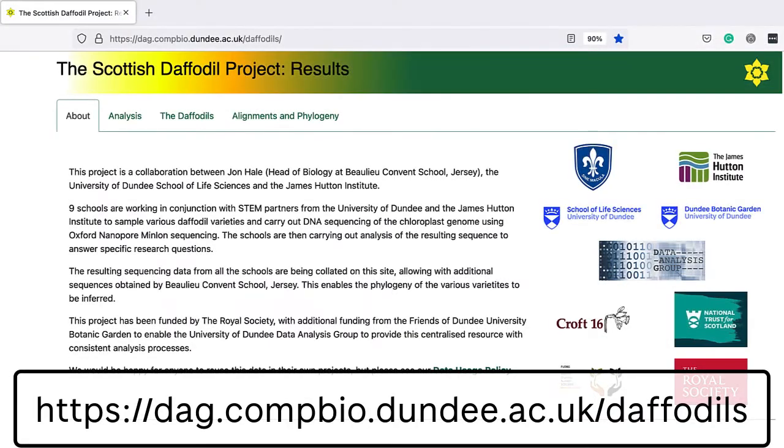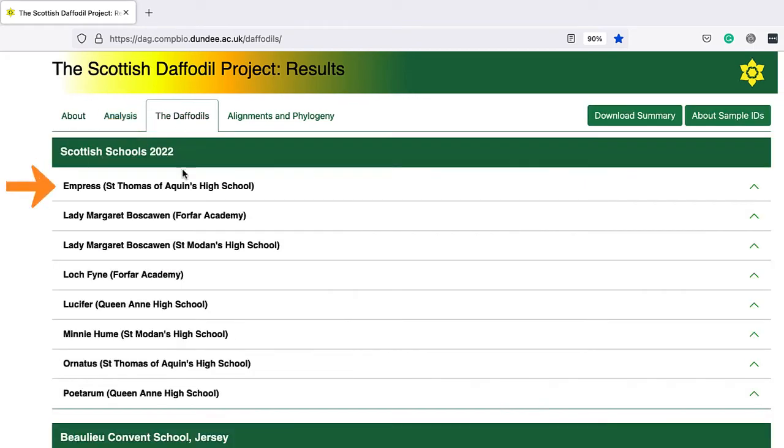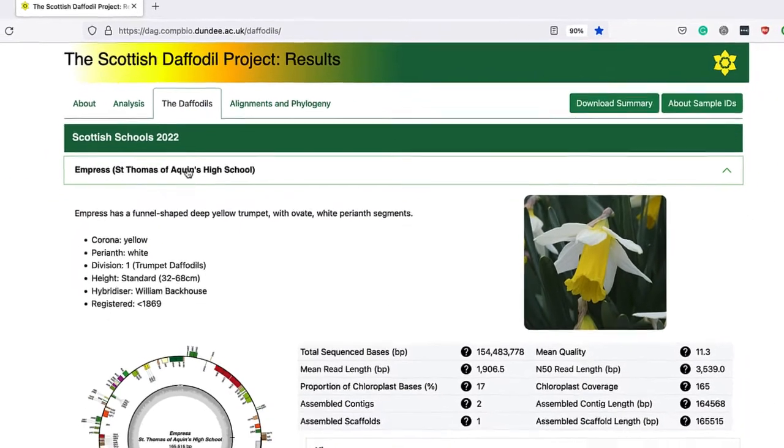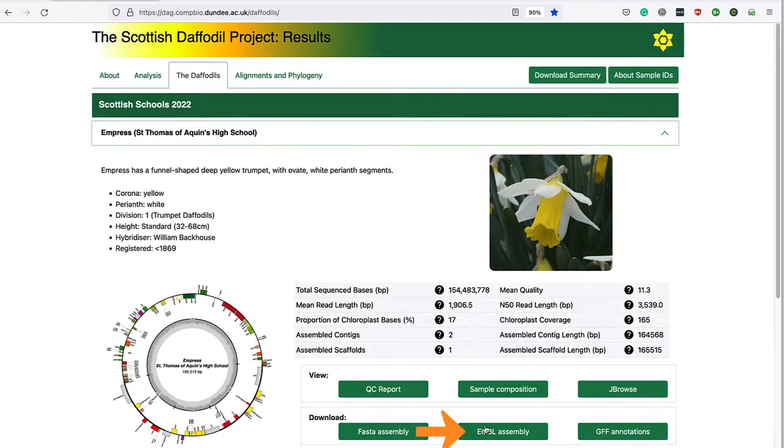I will download the EMBL file for the Empress cultivar from the Daffodil DNA Project website.